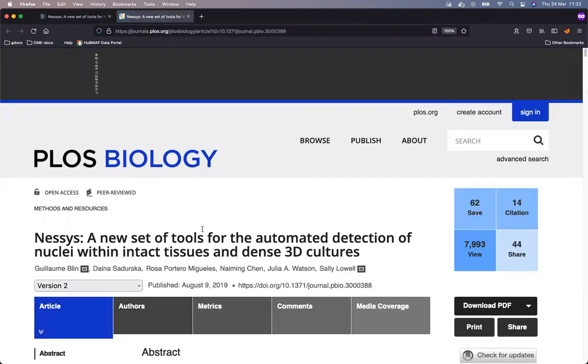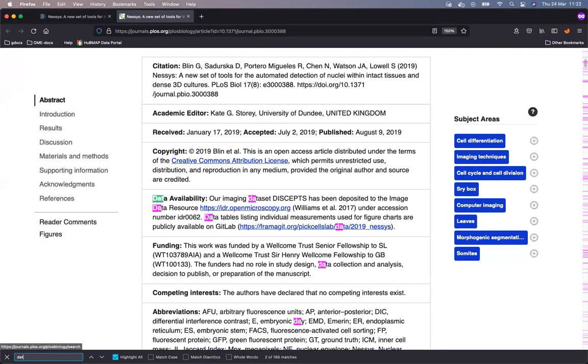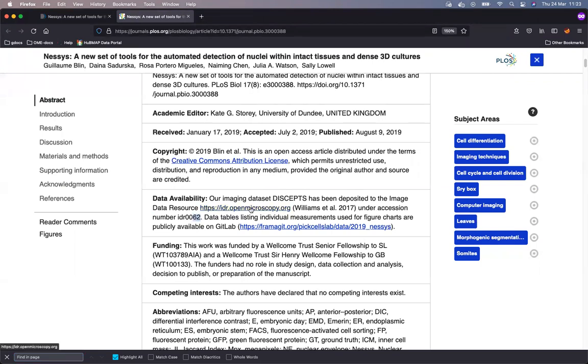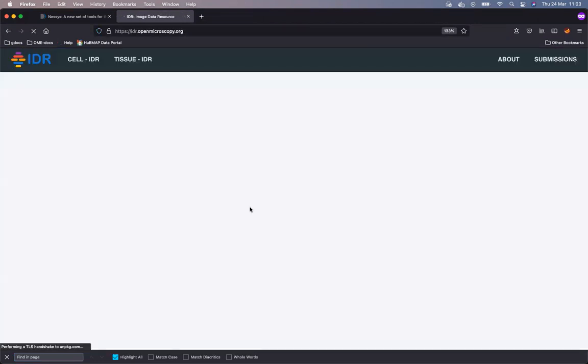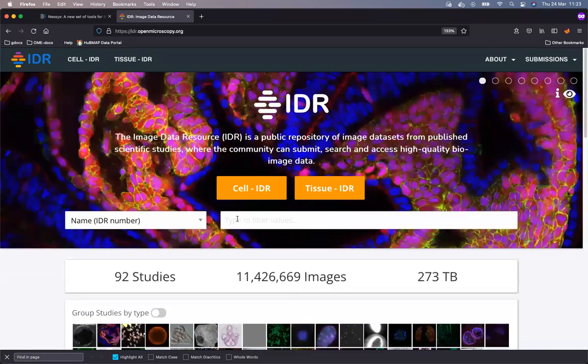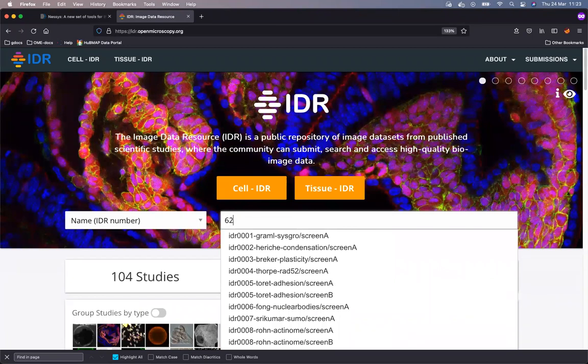I will start searching inside the publication for data availability section, which claims that the data has been deposited in the image data resource IDR under accession number 62. I click on the link to IDR and land in the IDR homepage and start searching for 62, which is the number I remember from the publication.